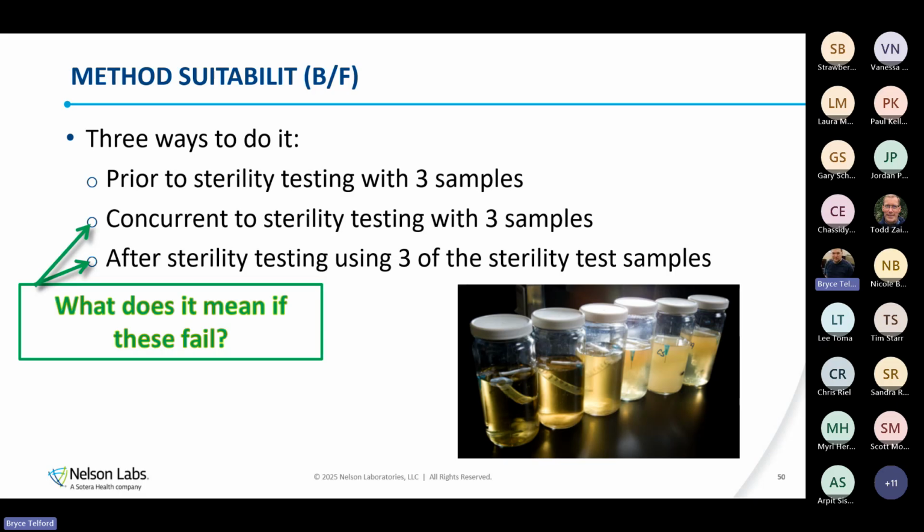And we went through multiple iterations trying to neutralize it because they didn't know what was potentially inhibitory. They said, well, there shouldn't be anything in it that's inhibitory. So we tried various neutralizers, just taking shots in the dark. And then finally, they got a hold of their material list and sent it over to me. And one of the ingredients was actually an antibiotic. It had an antibiotic coating.